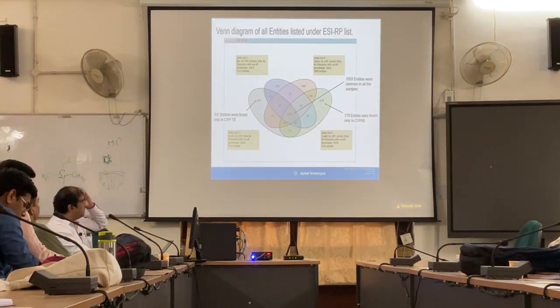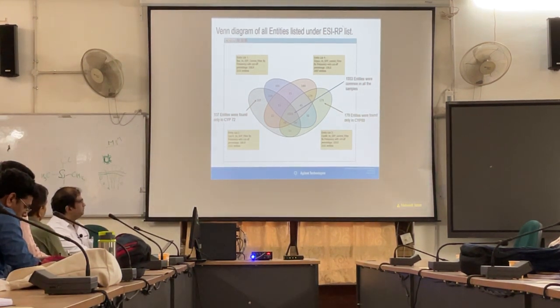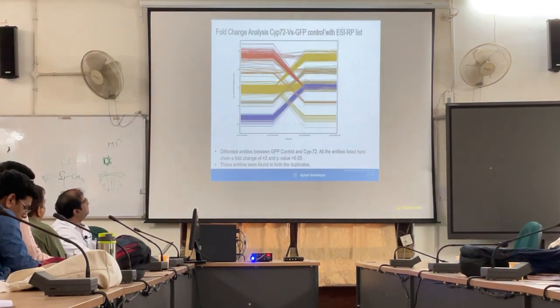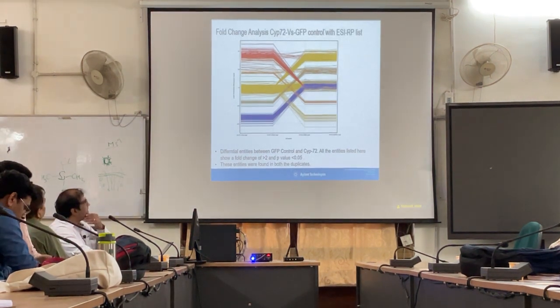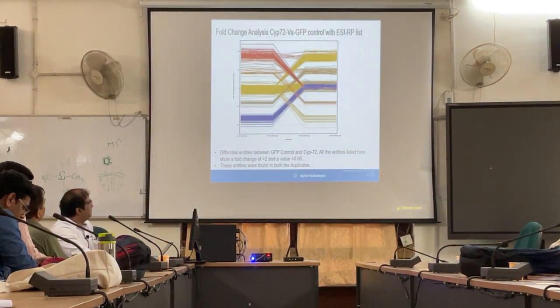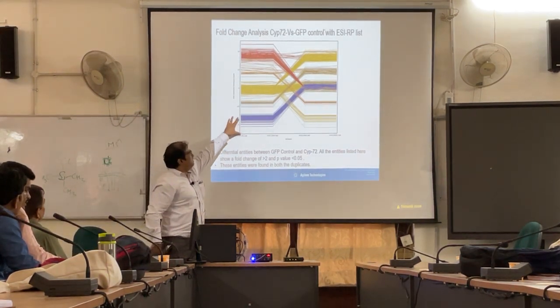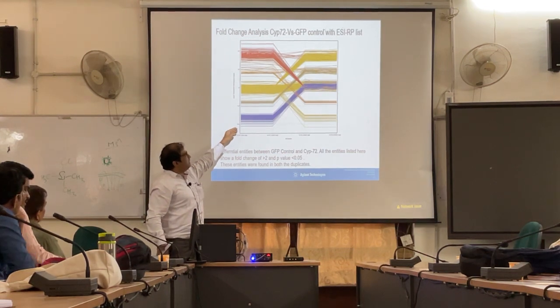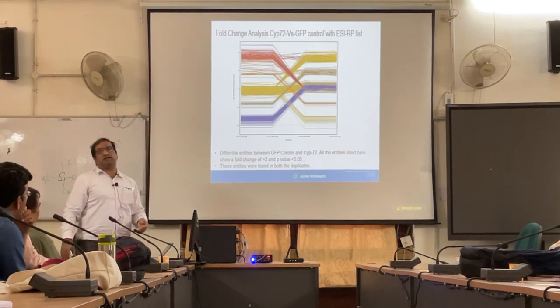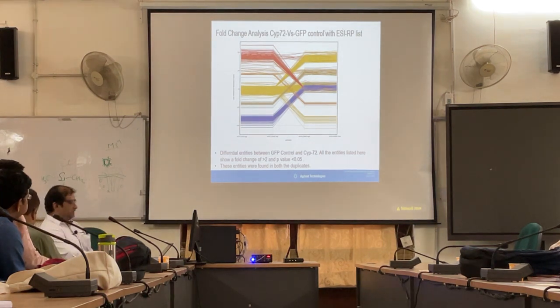So this is the data for one of the components. Now, if you see, there are various... so this is how you can establish; each line here is one data set. Okay? Each compound is a line, so here if you see in this control, this is the abundance of these many compounds, and how they are varying across different samples. That is what it is showing. This is one way of representing data, multiple data sets. So these are 3000 compounds which are represented here. That's how it is changing.